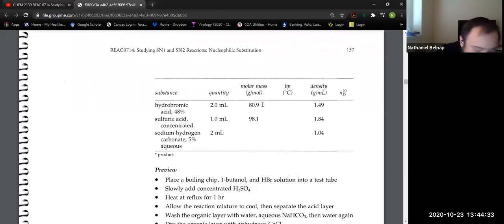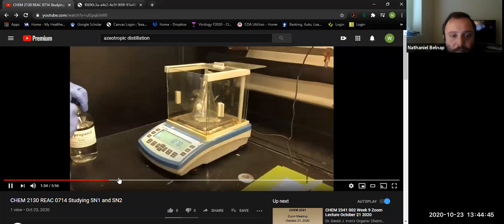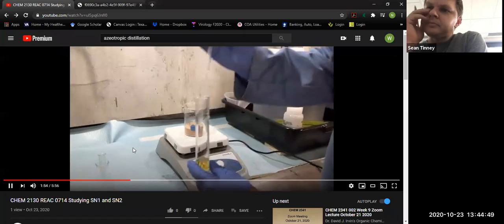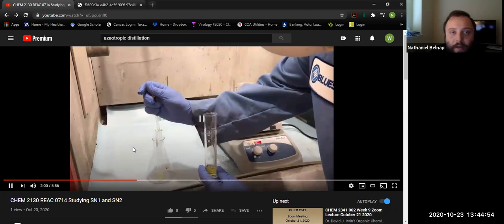And so instead of doing 1, how much did he have for the hydrobromic acid? Was there a specific weight for that? Or did he just add it to the total volume? Just added, I thought. I think it just adds it to the tube. So then you could just say 2 grams for that. So then you should get a value equal to 0.0247 moles of 1-bromobutane.